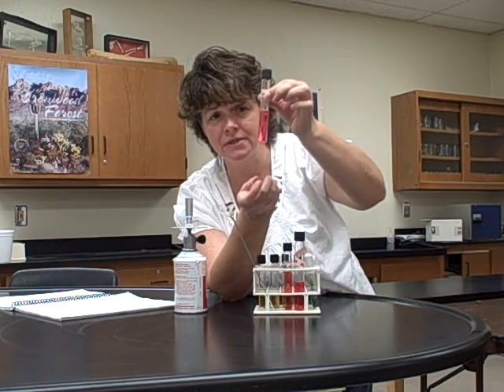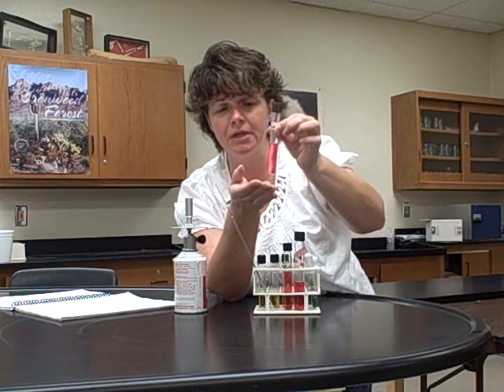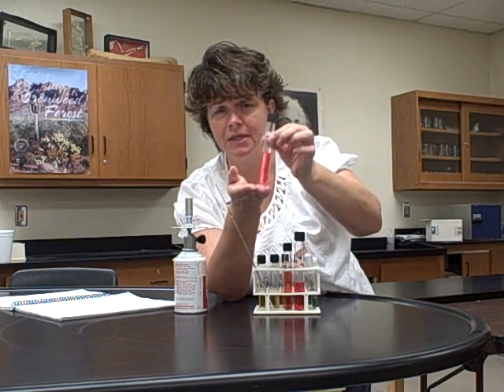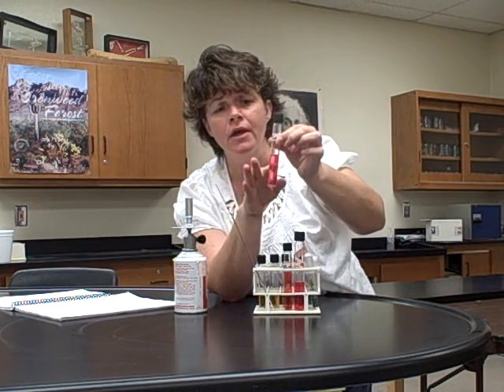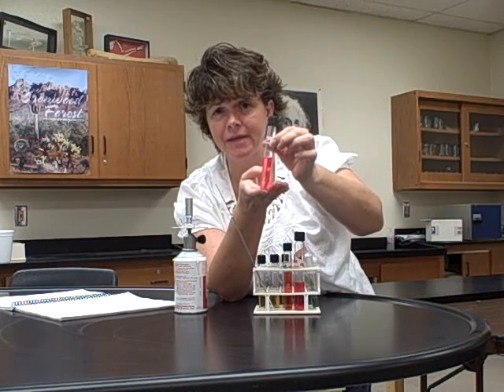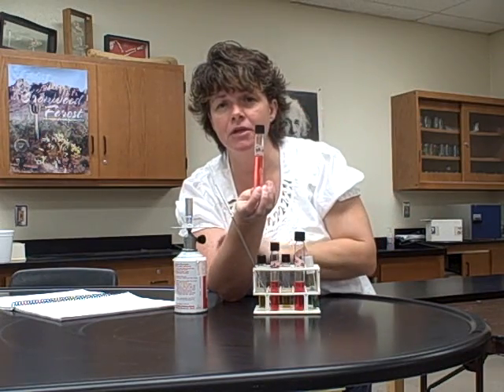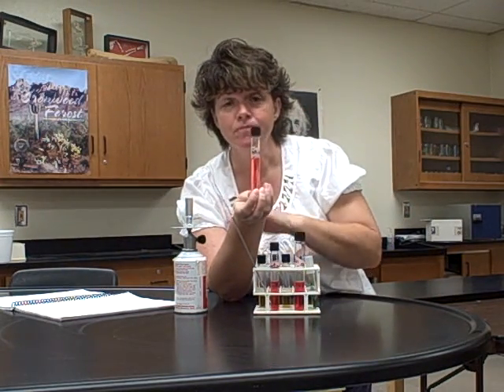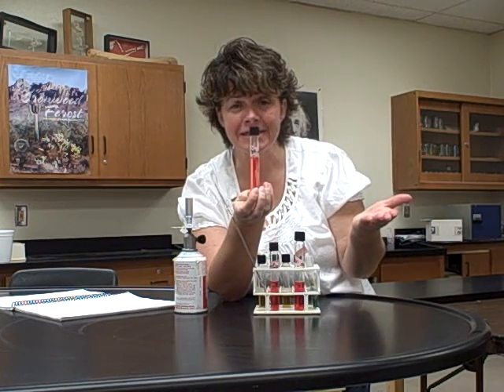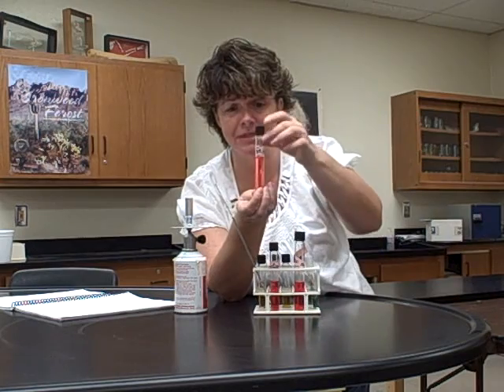Okay, so this one, since it didn't have a bubble, the next time when you go to look at it after it's been inoculated or sitting in the incubator for a week, you might notice a bubble in there, and then you would note that it produced gas. This one already has a bubble in it, so you'd have to make a note of the size of that bubble, so that when you go to look at it the next time, you'll have to note if it increased in size, the bubble itself.